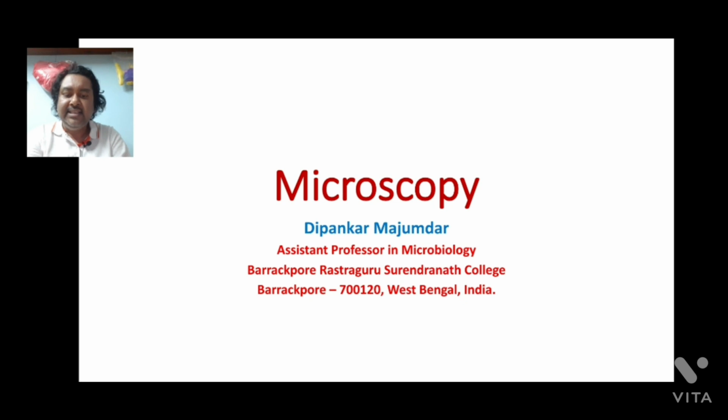The Zeiss optical works in Jena introduced phase contrast objectives and accessories in 1942, which transformed the research of biology and medicine. For this excellent invention and theory of image formation, Frits Zernike was awarded the Nobel Prize in Physics in 1953.